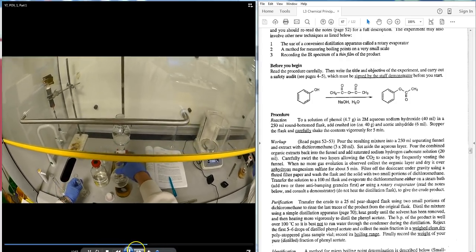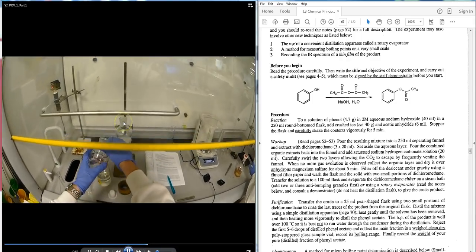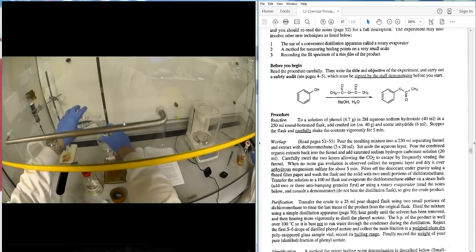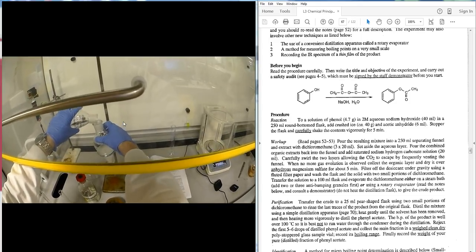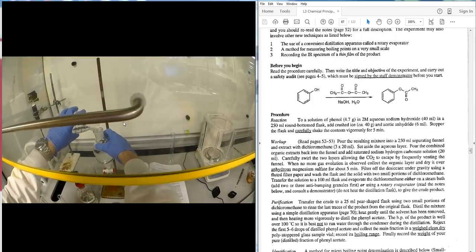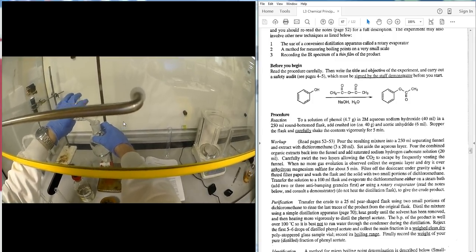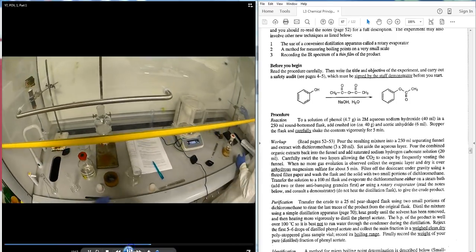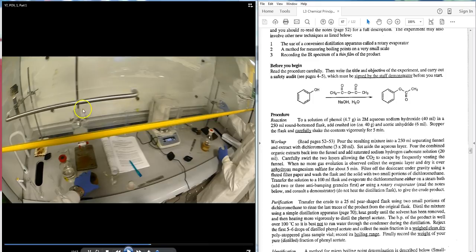After swirling the contents in, the student places the mixture into the separatory funnel. Before putting the stopper on, take some DCM and wash the neck of the separatory funnel so the stopper doesn't stick and all the organics are transferred into the funnel.